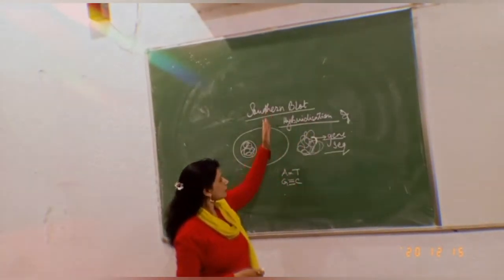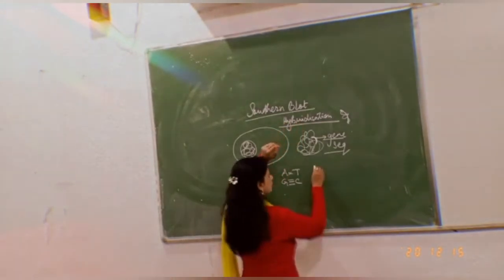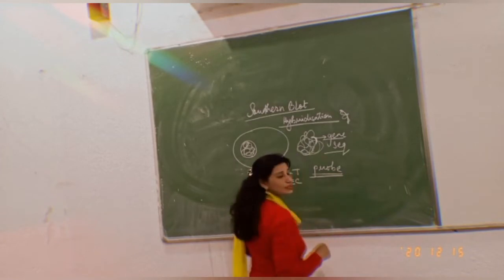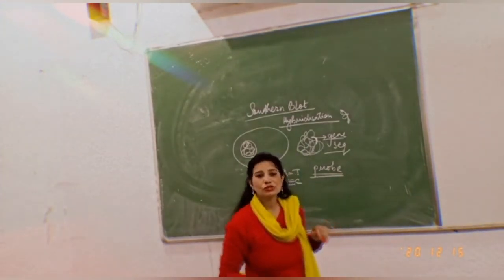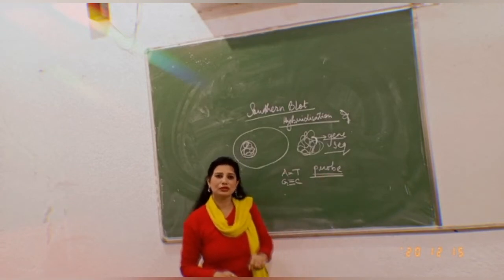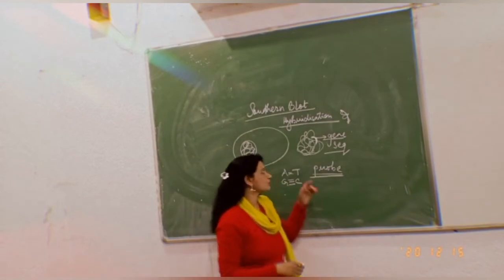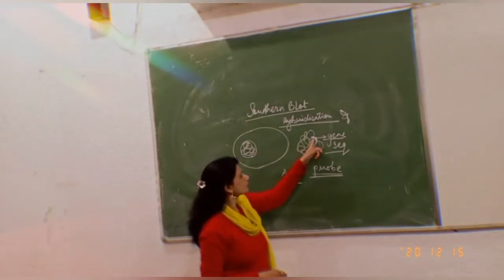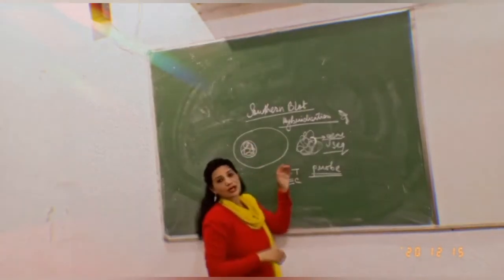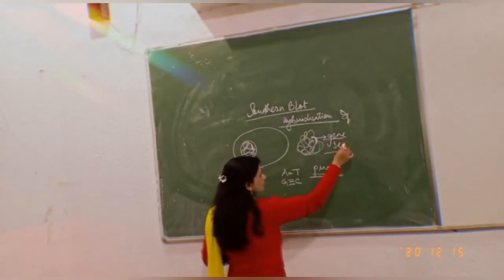In this Southern blot, I will be focusing on hybridization and a probe. What is a probe? A probe is a single-stranded DNA structure, or a strand, that we prepare in our laboratory. This will help us locate the particular gene sequence which is present there, which I have to find. I know my target gene sequence.